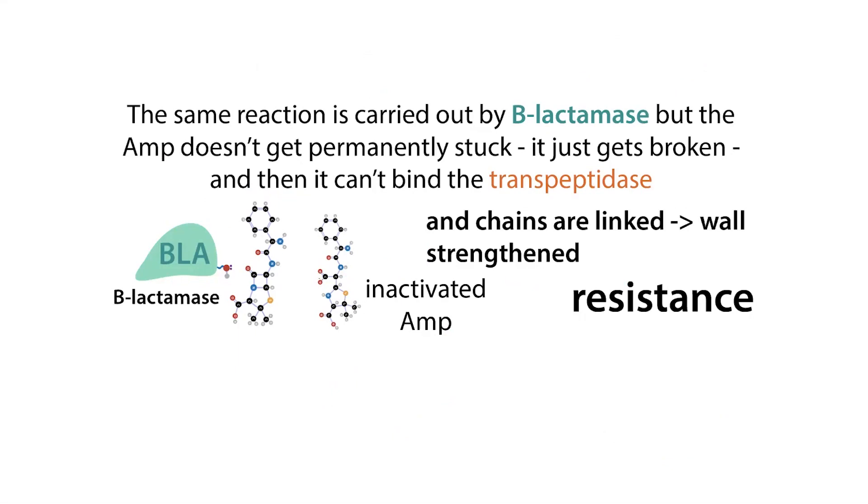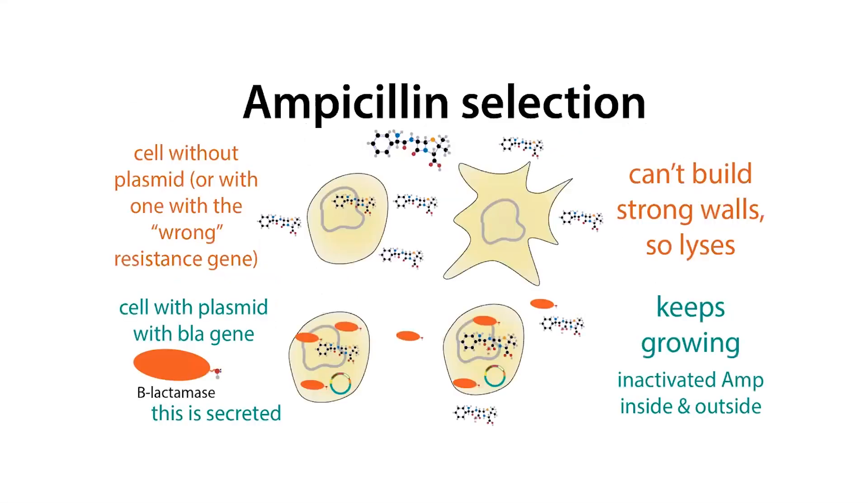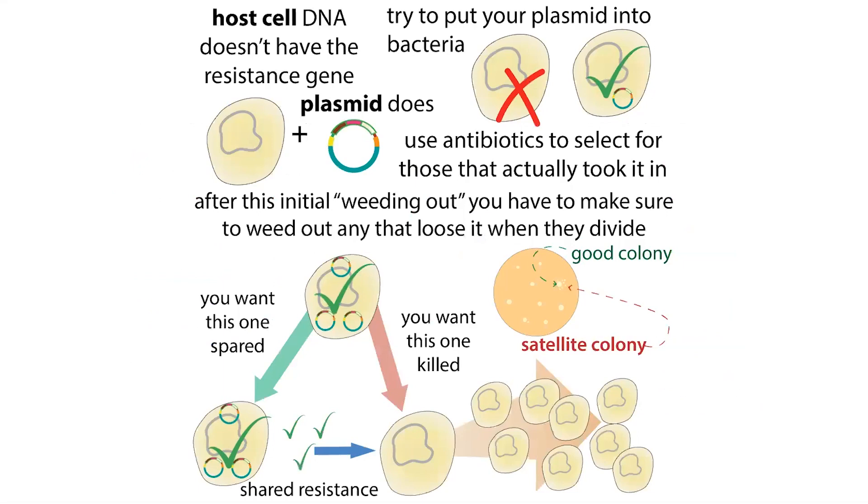This beta-lactamase protein that inactivates the antibiotic actually gets secreted by the cells that make it. These cells kind of go on the offensive — they're able to secrete this antibiotic resistance product outside of themselves so that they can destroy the antibiotics in their surroundings before those antibiotics can get in and start wreaking havoc. But by doing so, they're also kind of protecting the cells around them, which are going to have the advantage of being in the presence of the beta-lactamase. The beta-lactamase is destroying antibiotics in the environment, and these nearby cells don't have to produce that beta-lactamase themselves.